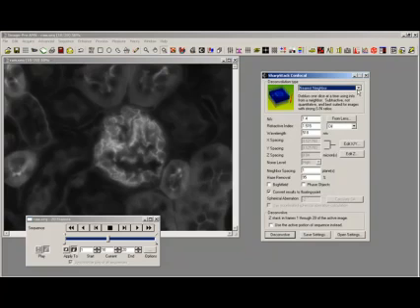In the top of my different algorithms that I can use, I have quite a few more because I have the extended package which allows me the blind deconvolutions, but in the normal packages you'll have the nearest neighbor, no neighbor, and inverse filter. So we just do a nearest neighbor.